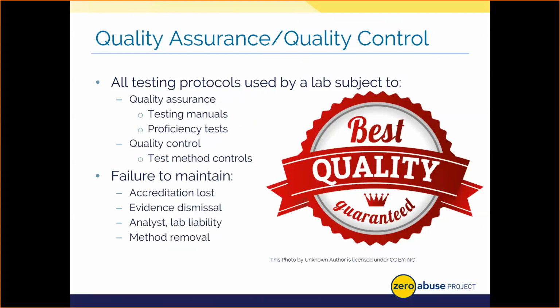Quality control then is product driven, in this case, test result driven. And it focuses on identifying issues with the given sample or batch of samples being tested. So quality control really monitors and confirms the precision and accuracy of our results. Some examples of good quality control: testing with positive and negative samples or controls, right? So samples that we know will turn because it's blood, or shouldn't turn because there's no blood present on that negative control.